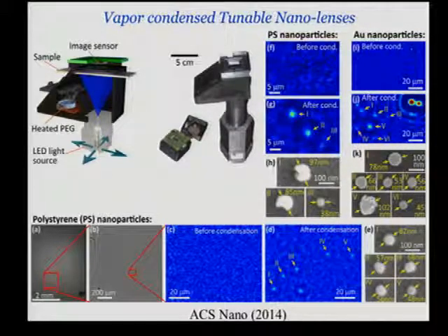This is actually a field-portable design that Dr. Ewan McLeod, who is right in the middle, has created. It's a platform which, over the same field of view, can look at particles as small as 40 nanometers and as large as a few hundred microns, a huge dynamic range in particle size and particle density, which is quite unique. In terms of looking at nanoparticles or microparticles in air or water, this kind of interface is quite unique because it can handle a large dynamic range in size and density in a field-portable implementation.